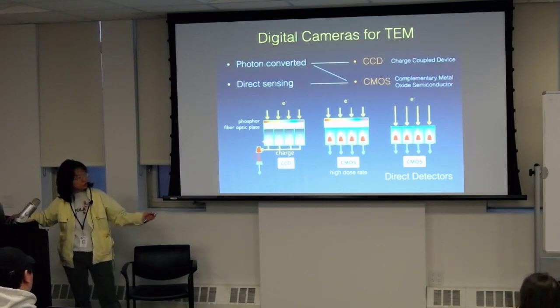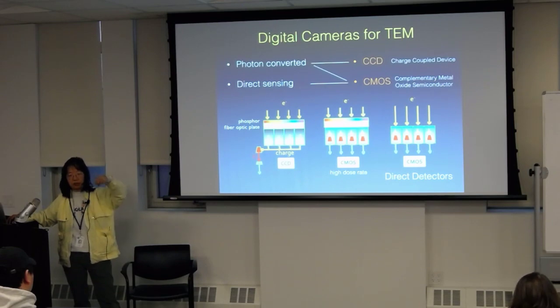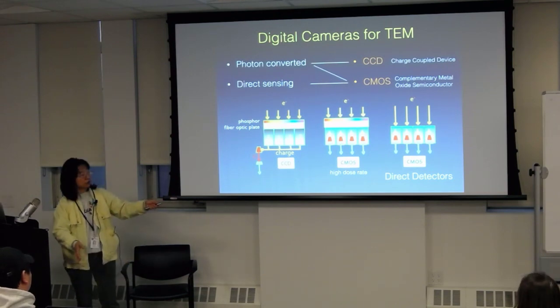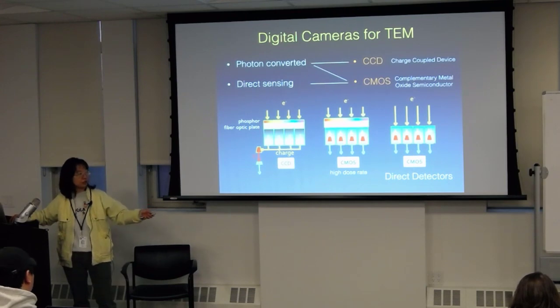So this type of camera is also very desirable today and very reliable. So these are the three types now. In terms of resolution that you are getting right now, this is the best. Part of the reason is that at the phosphor layer, where the electron goes in, the light coming out will also spread out, other than just going onto the sensor itself. So that spread doesn't exist in this condition, which makes it better.